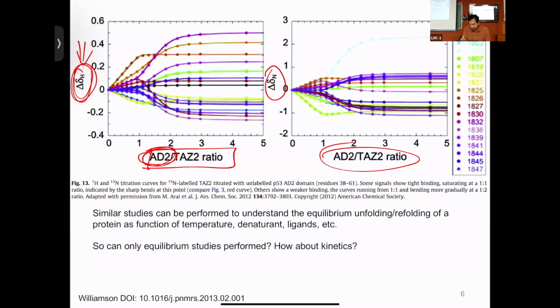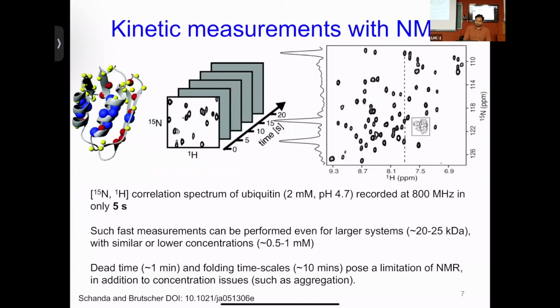For instance, the transition that happens here indicates that this part of the protein binds earlier than something like this. It's very, very important information to learn. Okay, these are just highlights. I'll send this to you. I request you guys to go back to some of these papers just to open and read the abstract and what they mean. Not just that, NMR chemical shifts could also be super helpful towards kinetic measurements.